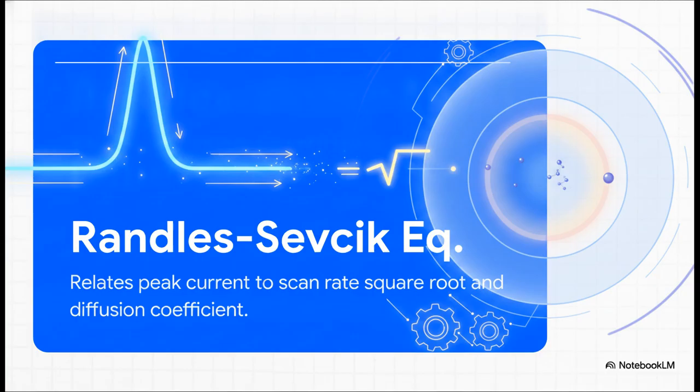By isolating this heavy-hitting equation right here, the Randles-Sevcik equation, we can see that faster scan rates predictably yield much larger peak currents. Why? Simply because that diffusion layer doesn't have the time to grow as thick. Notice how the peak current is directly proportional to the square root of the scan rate. It's essentially a microscopic tug of war between how fast you spin the voltage dial versus how fast the molecules can actually swim through the solution.